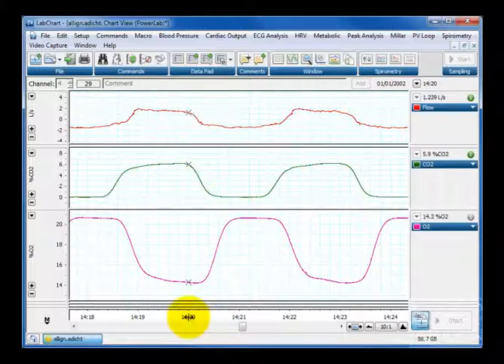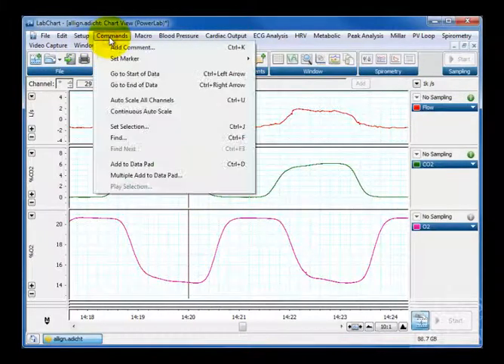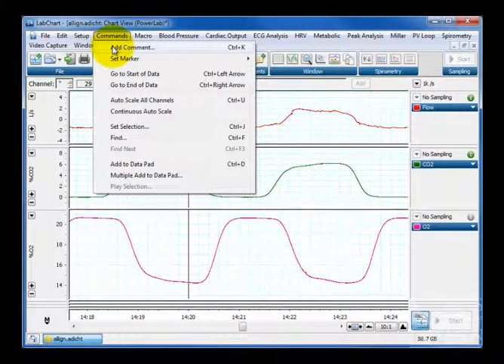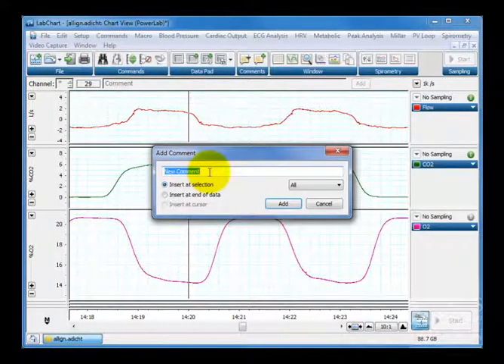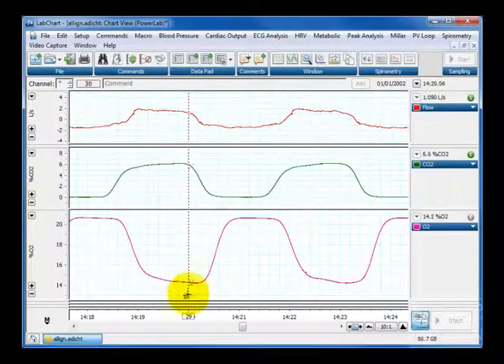So if I place my cursor where I believe the end tidal measurement should be taken, which is this point here, I'm going to add a marker just for the sake of doing the analysis. I'm going to add a comment and I'm going to call it just ET, and there we are we've got ET added.